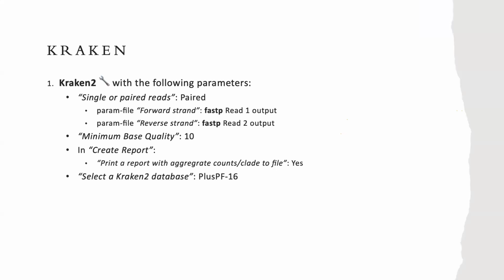Yeah, that's the thing. Sometimes even when you're in the same Galaxy interface, there are different versions, so you see different databases available. But you can improvise, because there's a latest database which is a little bigger. That's why I didn't suggest it, because it will take more time and we have limited time. So we are going to go with this one.